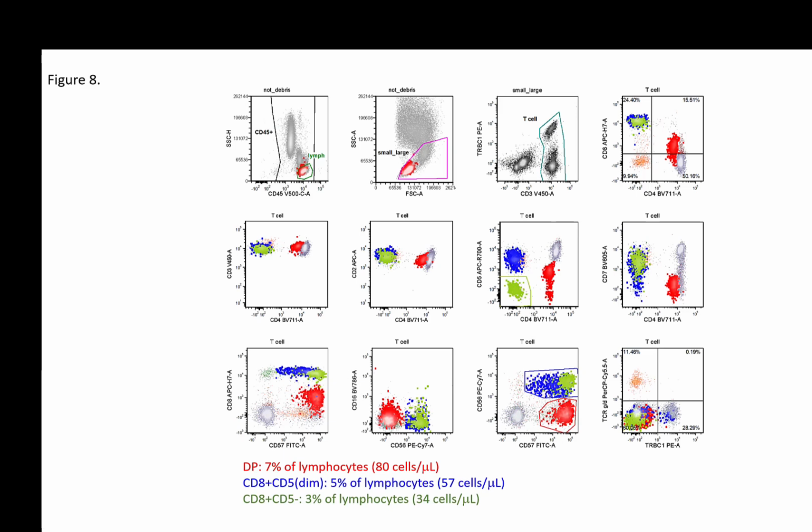In these kinds of cases, so TCUS, generally, in the original study from Mayo, the group showed that TCUSs show a lot of immunophenotypic overlap with LGL T cells. So it's really crucial for you to understand what an LGL T cell immunophenotype means, right? They're usually CD8s, and they usually have dimmer CD5. They may have more CD57. And some of them can also have double positivity, kind of like in this case. And generally, TCUSs, unlike LGL leukemias, tend to be smaller in number.